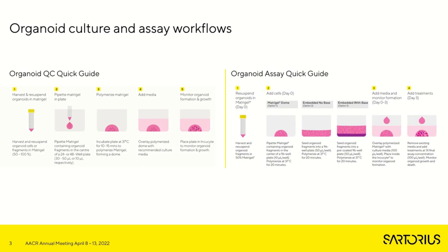For assay, the organoid Matrigel suspension is now seeded into 96 well plates using one of 3 validated formats, either as 10 microliter droplets or domes like the culture setting described, or as a 50 microliter suspension added directly to the assay plate. A third option, where 50 microliter suspension is added on top of a layer of pre-polymerized Matrigel. The choice of format is dictated by the health of the cultures and organoid morphology as visualized in the culture phase of the organoid workflow.